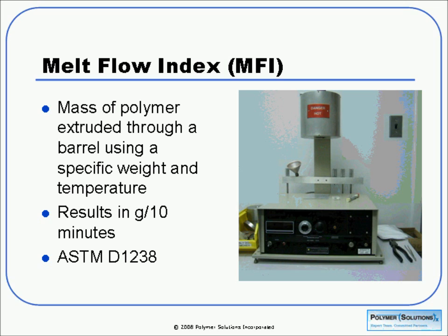The results are reported in grams per 10 minutes. It's roughly related to molecular weight and viscosity, but it is a single point measurement, so it can be misleading at times. But it is good to determine lot-to-lot variations and that sort of thing, and it can be used in line with processing. So in that case, it can be quite popular. There's an ASTM standard, D1238, and this is something that you might commonly see on spec sheets or technical data sheets.